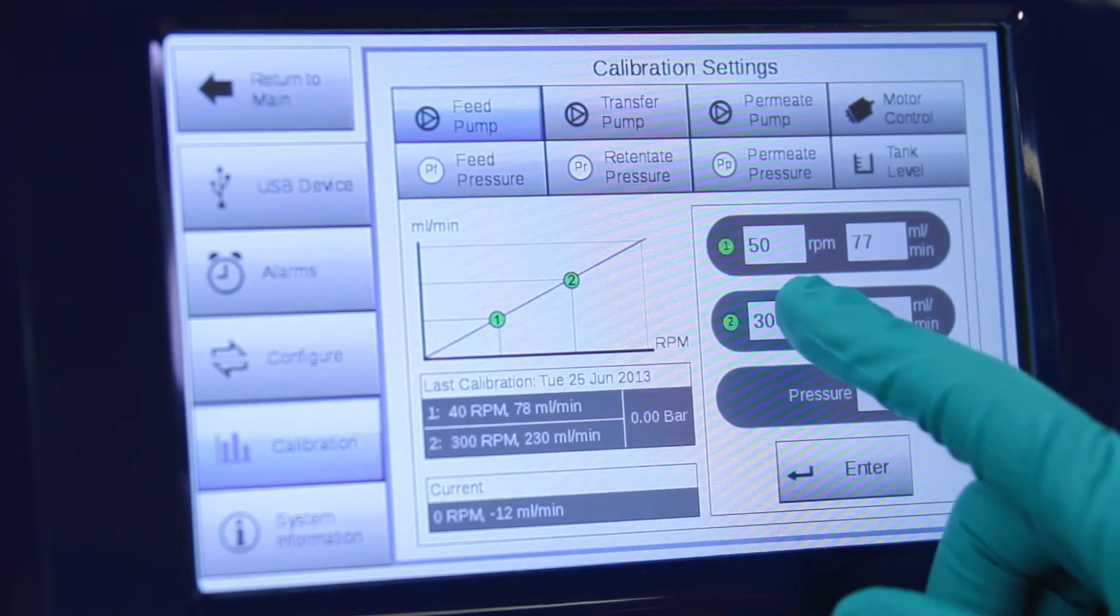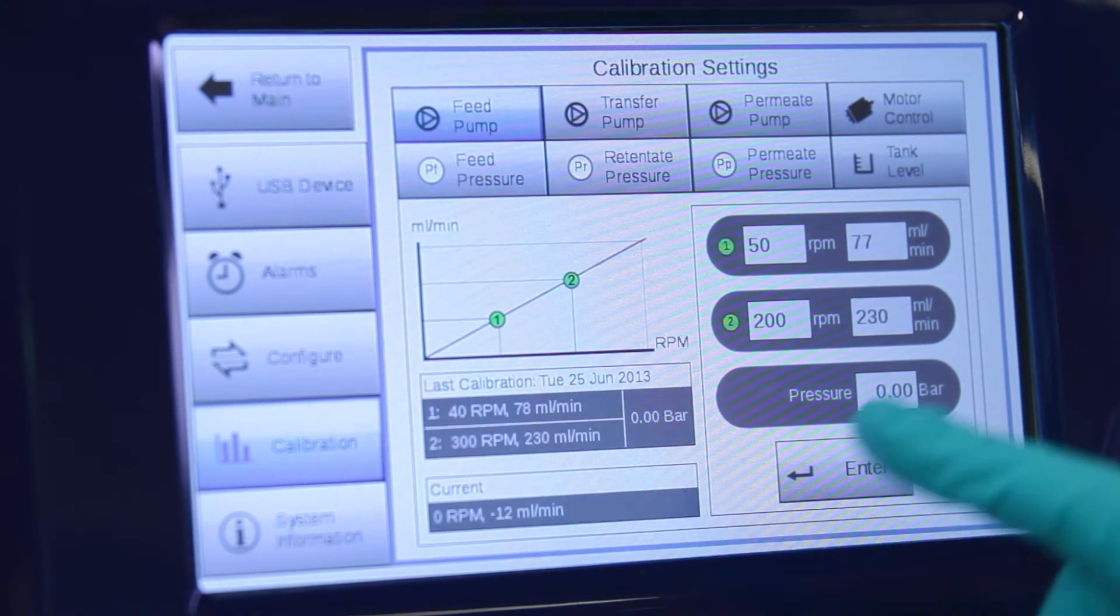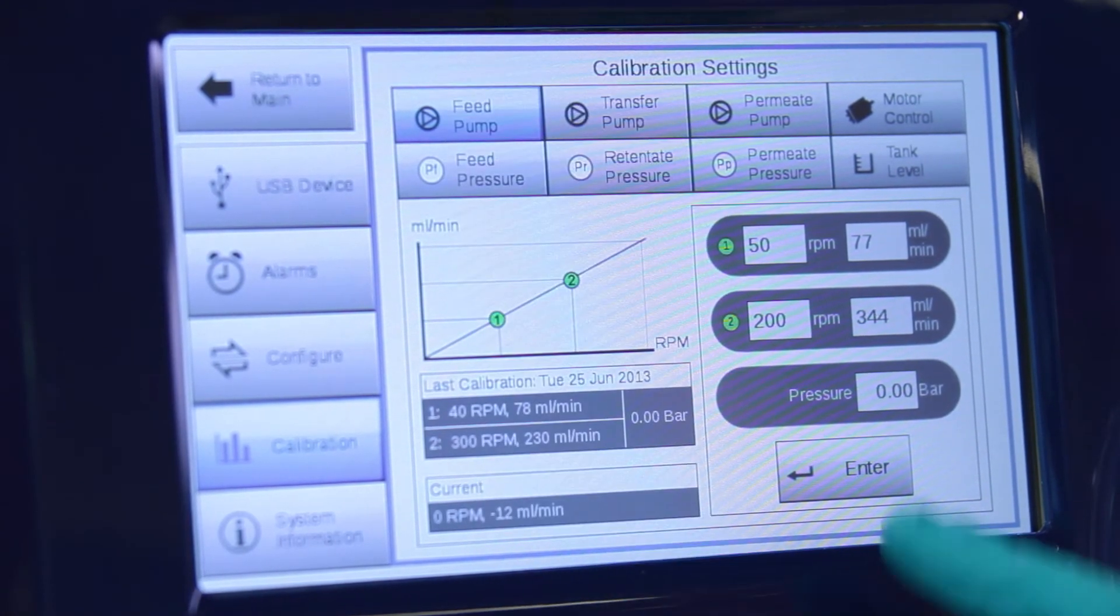The pressure used during calibration can be entered as a reminder. The transfer and permeate pumps are calibrated in the same way as the feed pump.